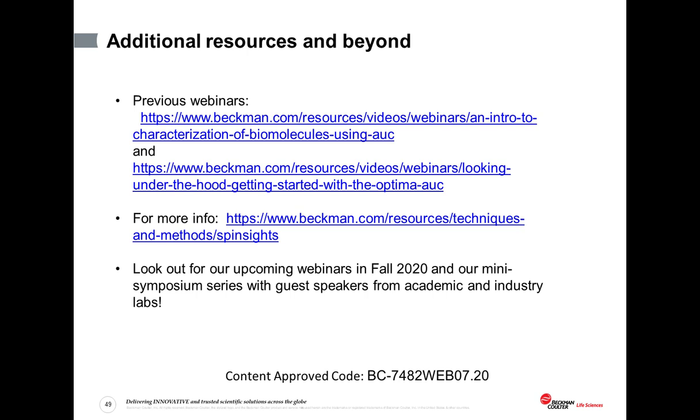The thing is that AUC is pretty much unparalleled in its dynamic range. I mean, AUC is probably the only technique which will give you an accurate estimation of molar masses of systems ranging from the size of a single peptide all the way to an intact virus. So, you know, something maybe like 100 daltons all the way up to the tens of megadaltons. So five-ish orders of magnitude. I don't think there are very many techniques out there which give you that kind of dynamic range. That being said, the caveat, of course, is that I'm not necessarily saying that you will get that information in a single experiment, although there are people who've designed extremely clever multi-speed experiments in which even that is possible. But yes, AUC does offer you an enormous dynamic range in terms of measurement, which I don't believe SEC-MALS can actually access.